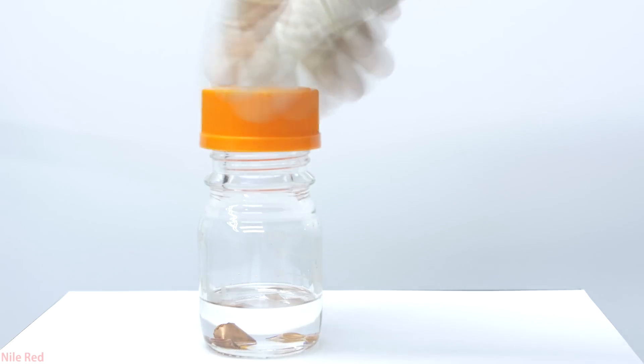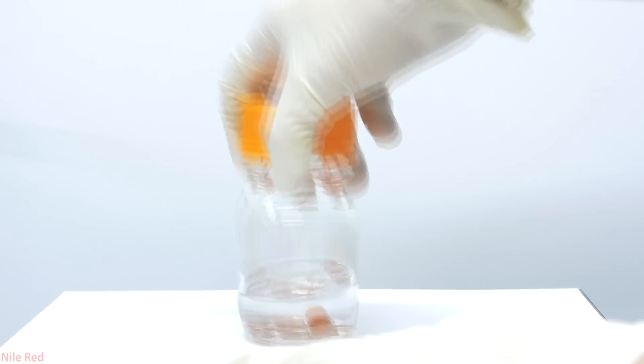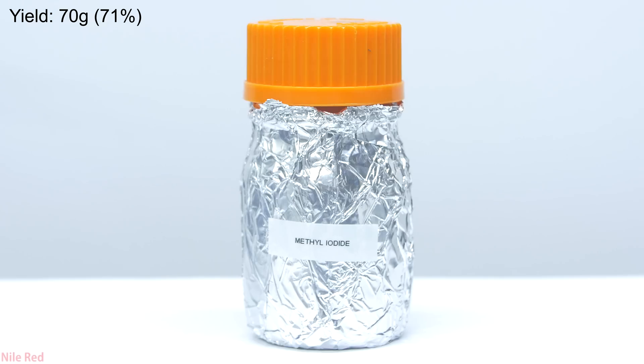Once everything's been added, I remove the funnel and cap it nice and tightly. As I said before, it's sensitive to light, and I didn't have a glass amber bottle, so the next best thing is to wrap it in aluminum foil. The yield in the end was around 70 grams, which represents a percent yield of about 71%, which to me is decent.